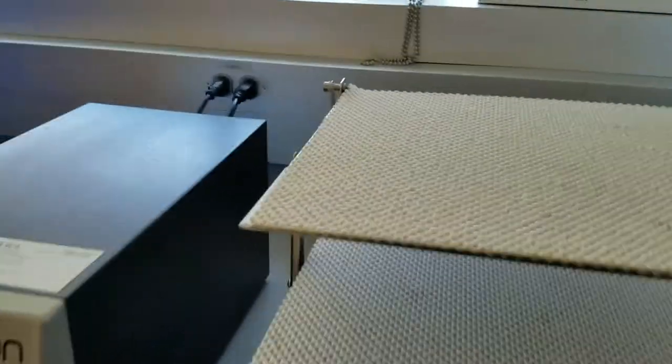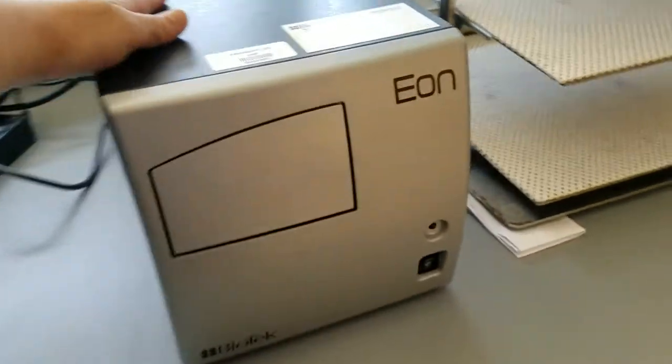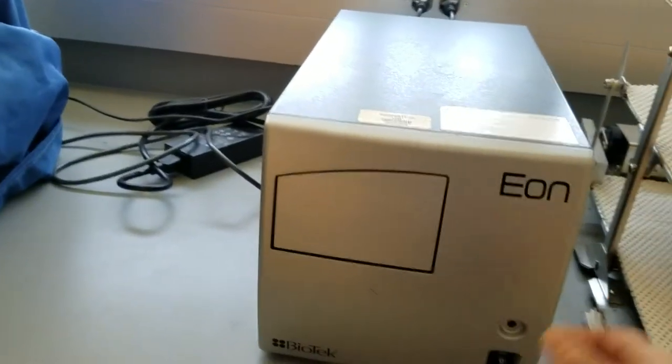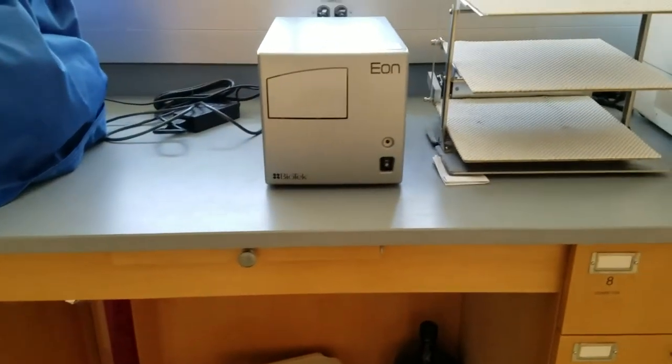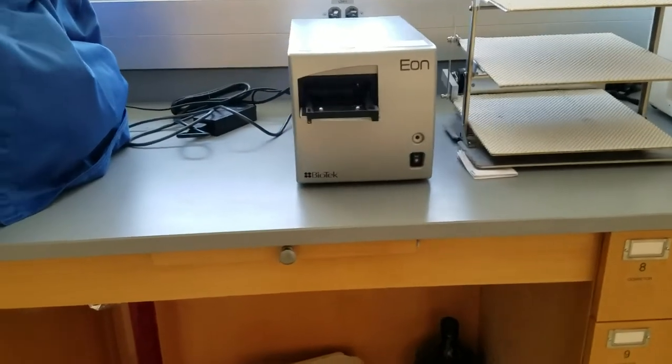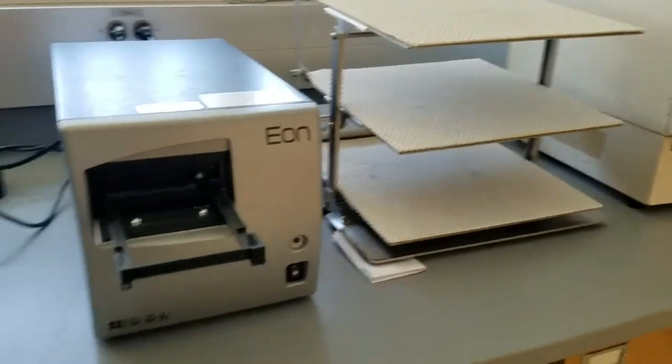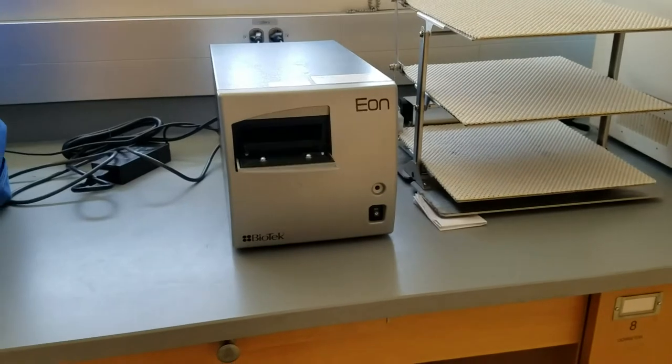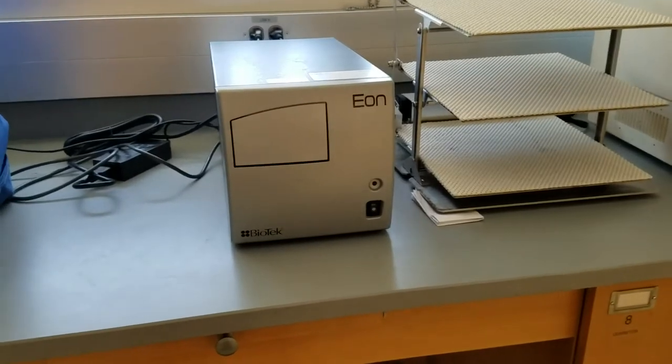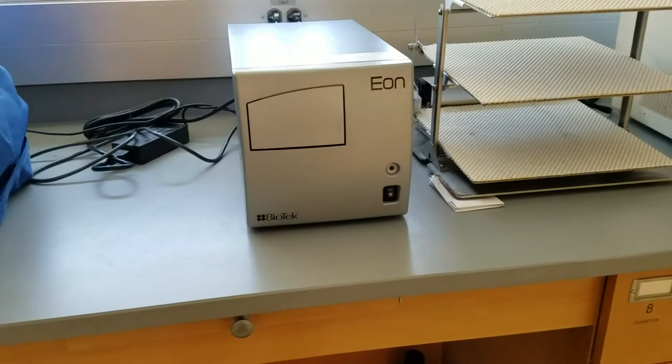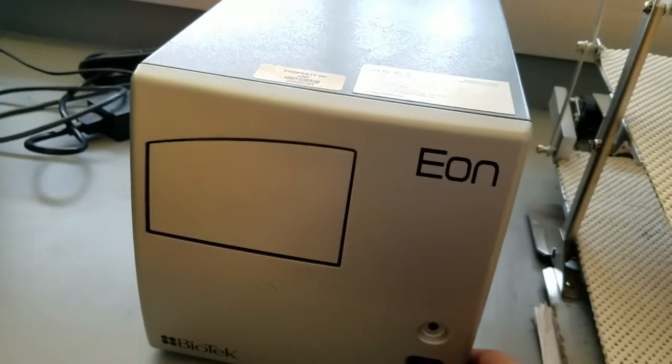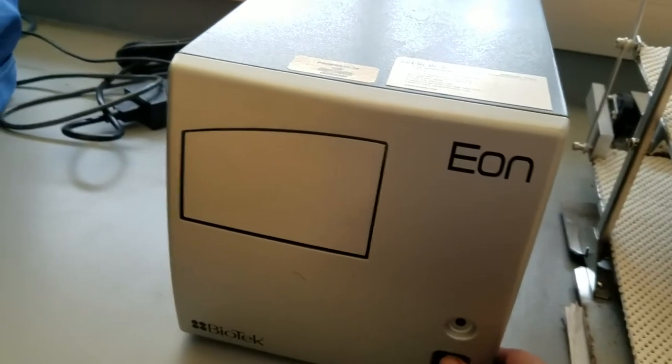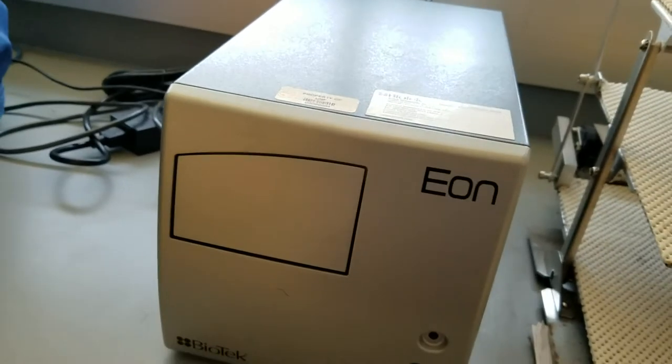Here I have a plate reader. This plate reader is used to look at absorbance at various wavelengths that we may need. It takes 96 well plates. It can also be used to incubate experiments at a particular temperature during incubation before the absorbance is read. It reads both UV spectrum as well as normal visible light, so it's a great spectrophotometric system. It can take 96 samples at a time instead of using one cuvette for each sample separately.